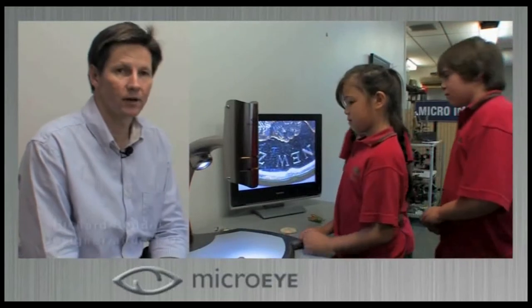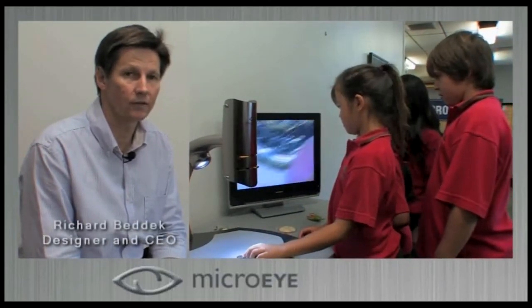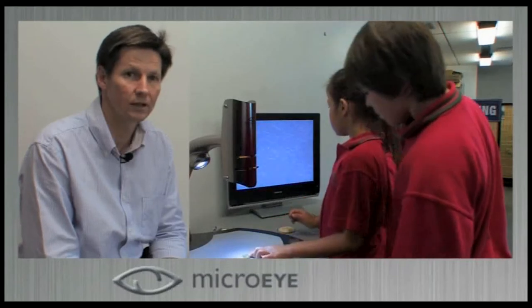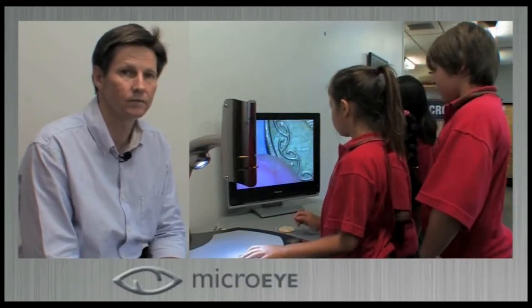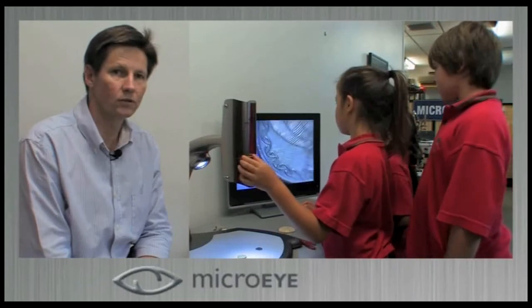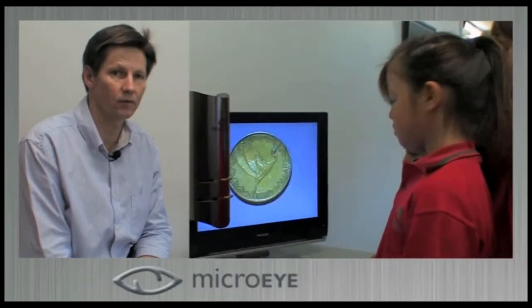With my background in microscopy, I realised that if you put a standard microscope into a public interactive environment, it just would not last. So I decided that it was necessary to design a completely new, unique microscope that was first of all robust, but also easy to use. I looked at the design of standard microscopes and I thought to myself, what does it need to do in that sort of environment? So I came up with an instrument that was very simple to use, but robust.